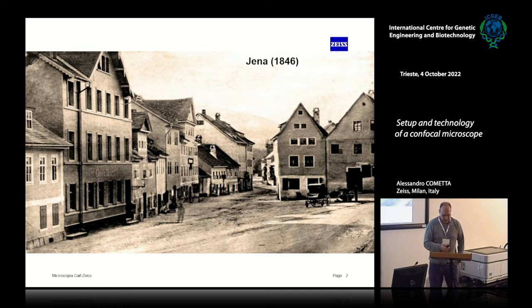And this kind of microscope was not performing as expected, because every single microscope had to be built from single lenses by a procedure of trial and error. So there were no identical microscopes. Two microscopes are different from each other. They just had to put the lenses together and look if the result was good enough or not. You can imagine that for a German of that time, something like that was absolutely not acceptable.